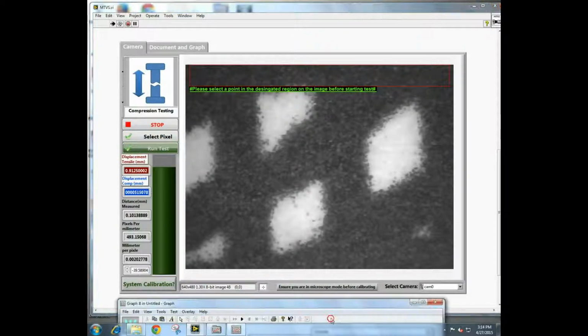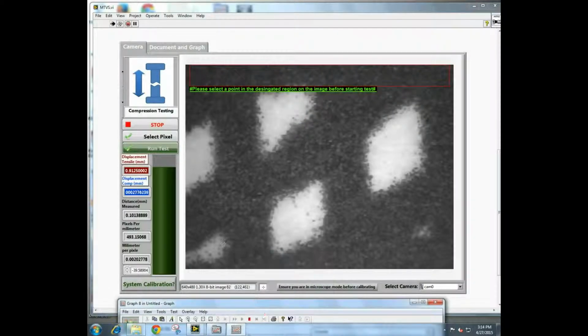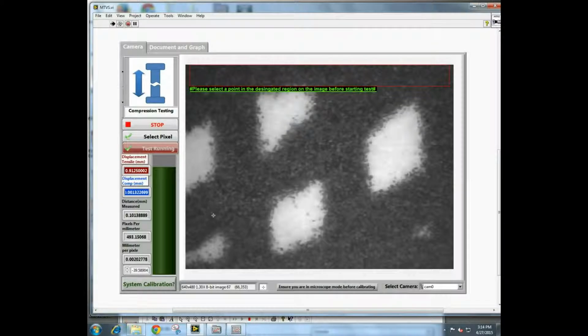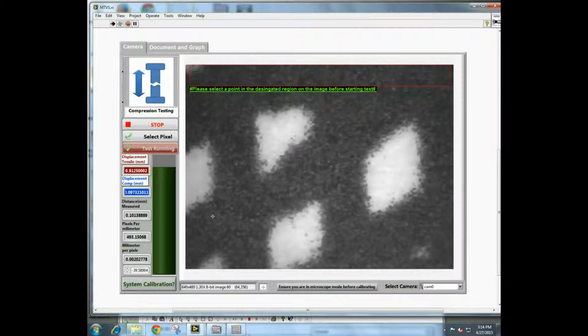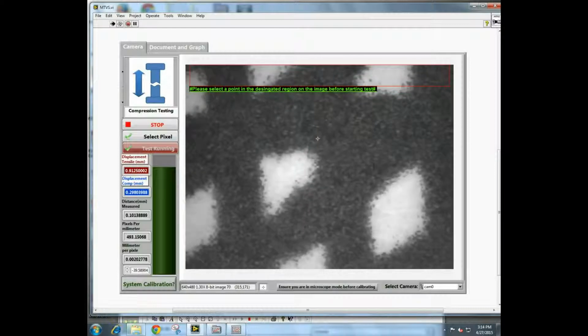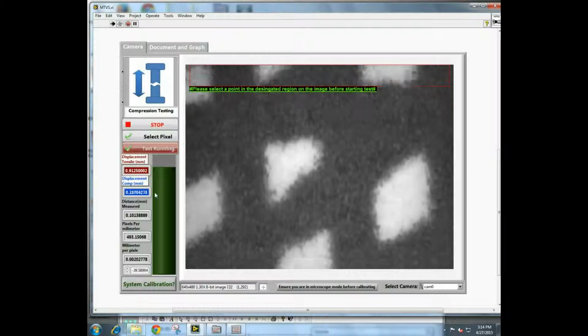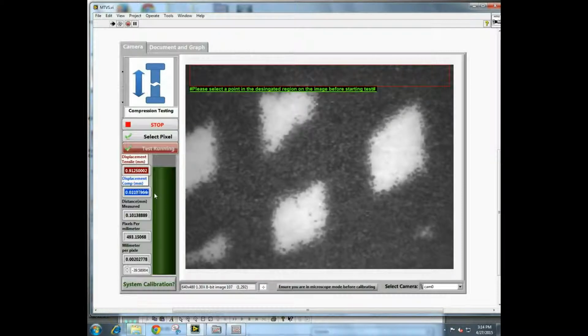Now we deal with the next-gen part of the test, and before you press run test, the test will now be running, and as you can see, displacement is reading the y-axis of the red particle. The test is finished, and that value will be written in a 1D array to graph, and we end the test.